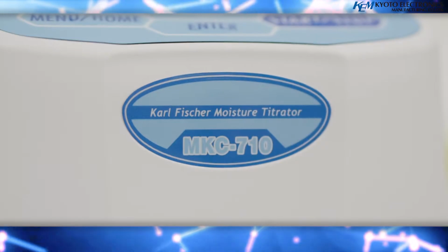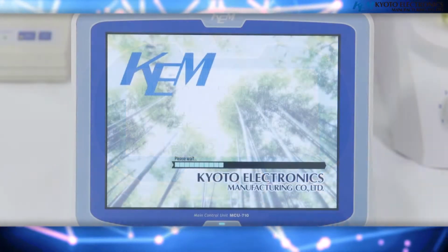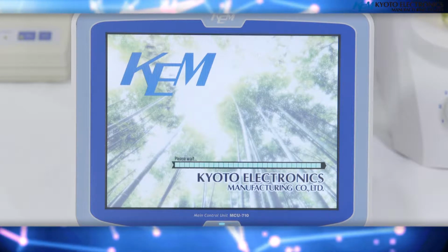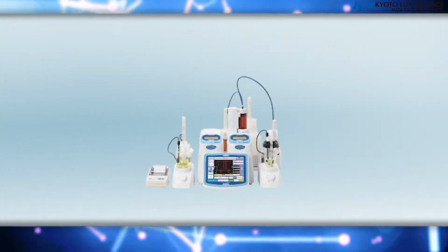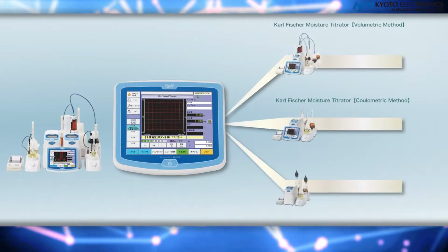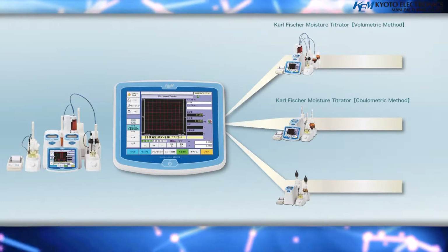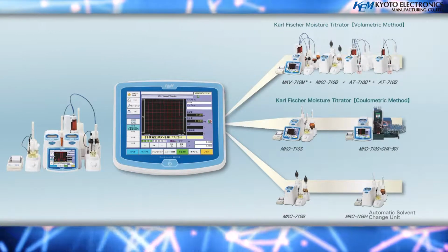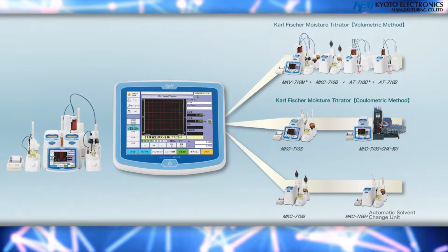By connecting up to 4 moisture titrators, measurements can be performed simultaneously in parallel and contribute to saving space. Not only can the Karl Fischer Moisture Titrator's coulometric titration, MKC710B, and volumetric titration, MKV710B, be connected, but the automatic potentiometric titrator, AT710B, can also be connected as well.